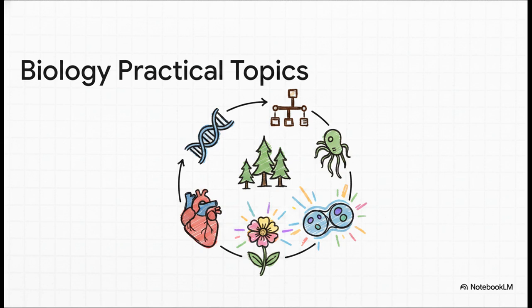Just look at the sheer diversity of topics we cover here. It's incredible. We're spanning the entire biological spectrum, from isolating actual plant DNA and drafting pedigree charts to track genetic traits, all the way over to identifying disease-causing organisms like Ascaris and Plasmodium. We even get into mammalian biology, looking at blastula development, heart sections, the whole shebang.